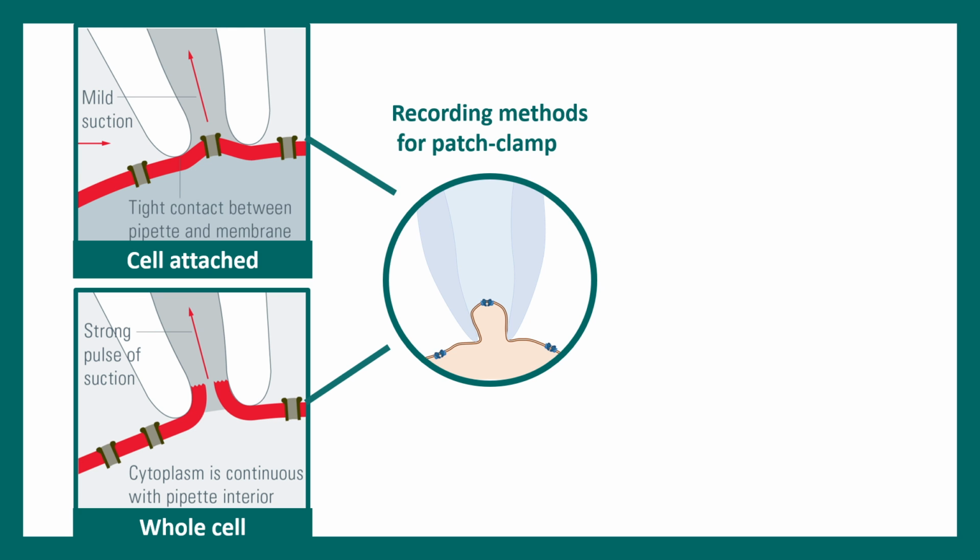That is called cell attached recording setup. The second one is whole cell patch clamp. In this case, you start like a cell attached recording pattern. You establish the gigaohm seal, but then you further apply a brief suction. Brief intense suction breaks the membrane and makes the neuronal interior continuous with the pipette solution. So overall neuronal property can be determined using a whole cell patch clamp.